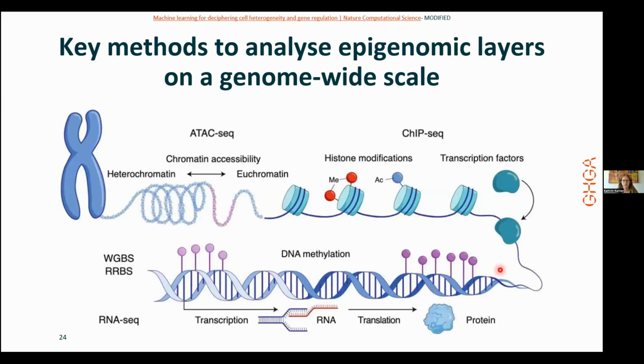We've already seen that there are really a lot of different epigenetic modifications. And of course, there are also a lot of different methods. Today, I just want to show several, I would say, the most important or the most favorite methods which are widely adopted in the community. And of course, for each of these methods, there are a lot of different protocols out there with a lot of different versions. But I will just focus on the principles of the methods.